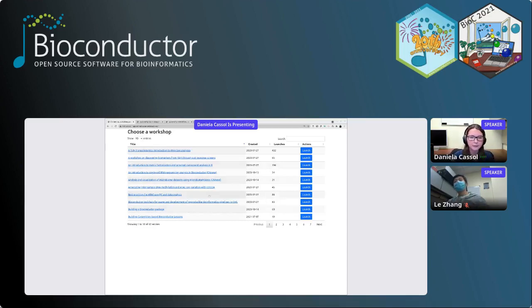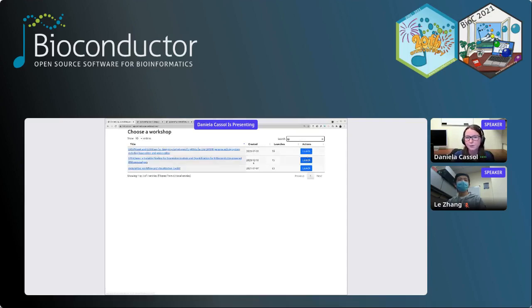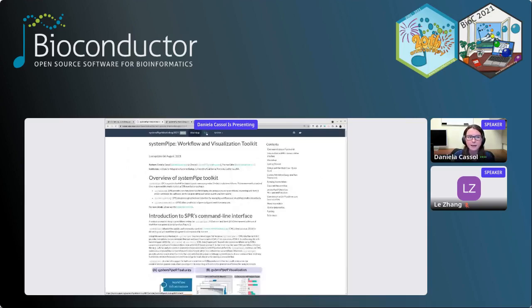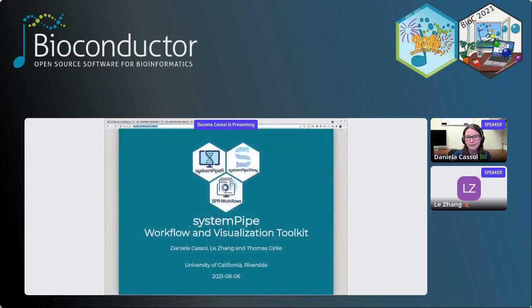So I will share my screen here, so you can see the Orchestra webpage, and up here you can search for our workshop, which is called systemPipe Workflow and Visualization Toolkit. And then if you click here on the launch, you can go ahead and click already because it can take a few minutes. But also if you click here, that will jump to our webpage. And so up here, you can find the main vignette, and here you can find our slides. So I'll begin sharing those slides.